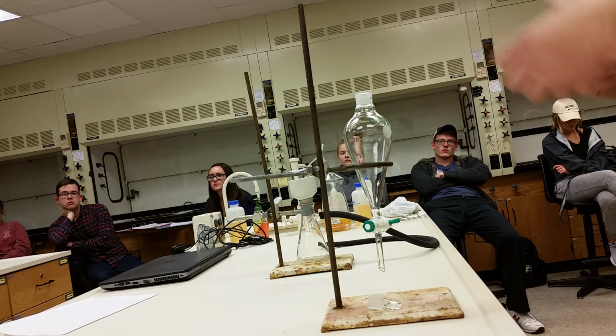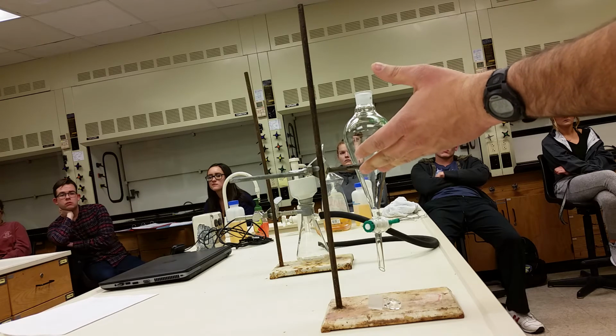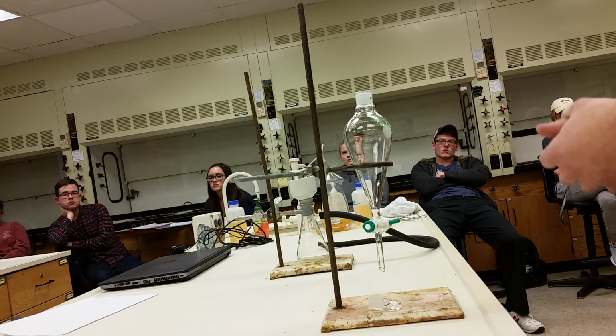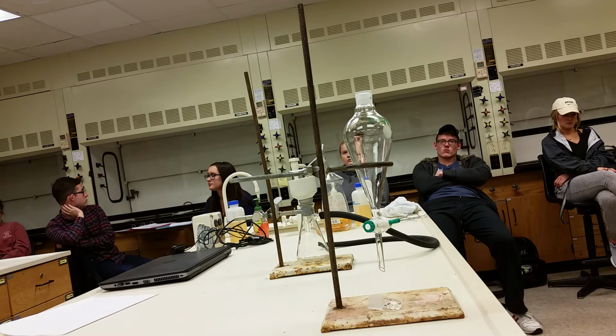Rinse with a little bit of ethyl acetate. All the magnesium sulfate will be caught in the filter paper, and your compound and the ethyl acetate will go into the beaker. Then you take the beaker, put it on the hot plate, and boil. You evaporate off the solvent.